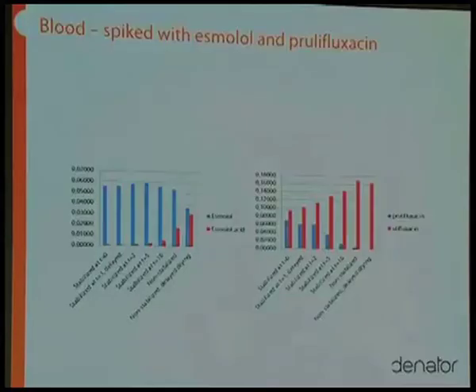This example is even more striking. Same type of experiment, and here it really shows if you wait 1 minute, 2 minutes, 5 minutes, 10 minutes, the mother compound is rapidly degraded. And here already at time 0, more than half of the compound that we added has been converted to the degradation fragment. And when we look at the non-stabilized, the standard way of working with this, we see that almost all has been converted into this active form.